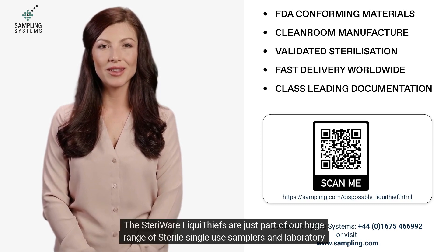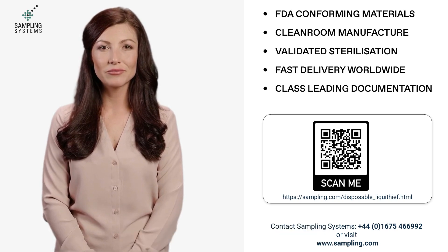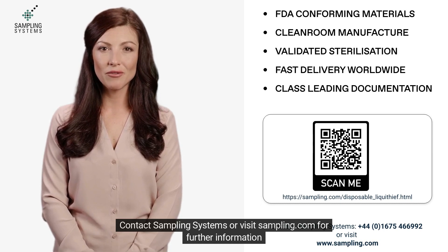The SteriWare LiquiThiefs are just part of our huge range of sterile single-use samplers and laboratory ware. Contact Sampling Systems or visit sampling.com for further information.